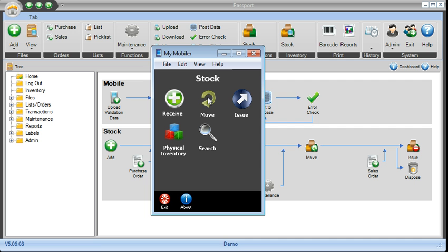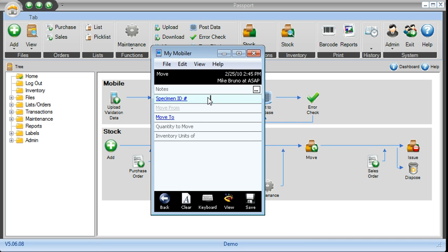So you can receive, move items between locations. So the movement, again, with your finger, you tap there, you scan the specimen ID, scan where you want to move it to, put in the quantities.